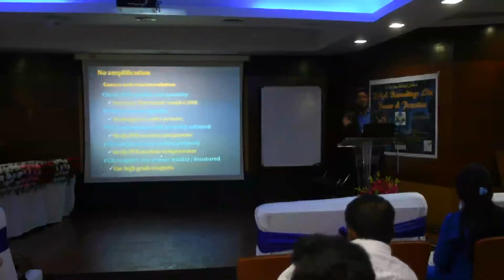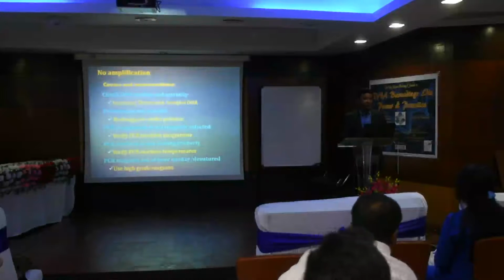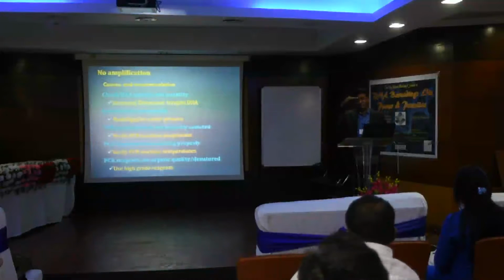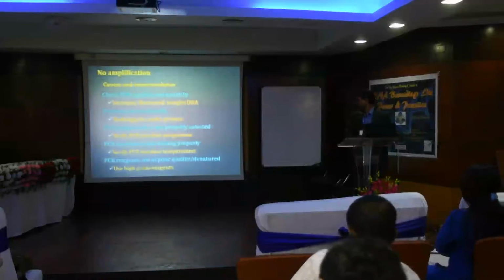Once we got one new machine, the company sent us. They said you test it, you keep it with you and test it. If you like it, then we'll offer a special price for you. And that machine was having one step where it was stopping. Properly it was starting, but after that it was stopping. The heating head of the PCR was not heating, and the machine was not showing anything. So this can happen with machines also. Machines are not perfect like us. They can have problems. So be considering those things.